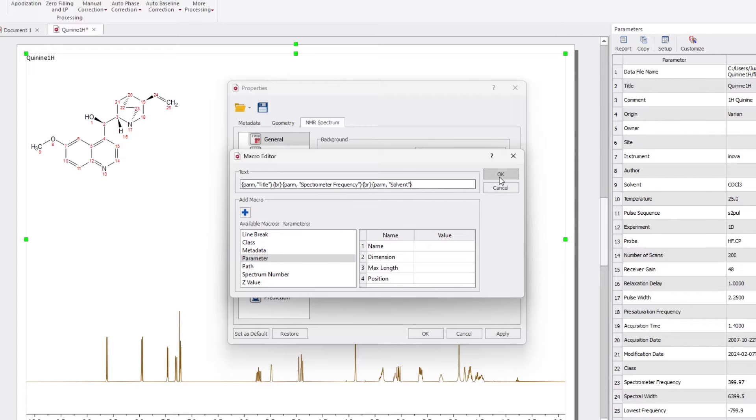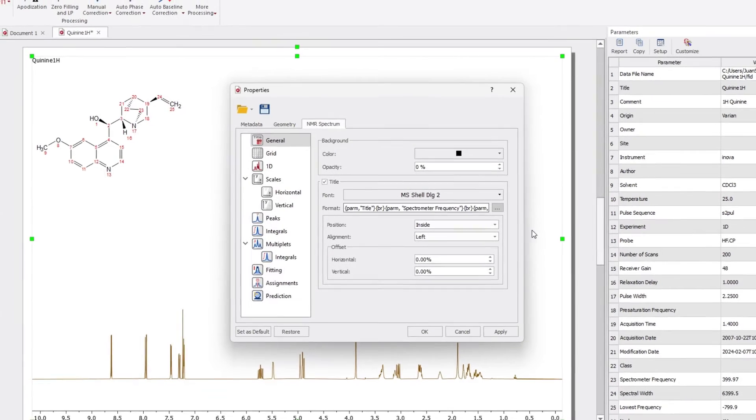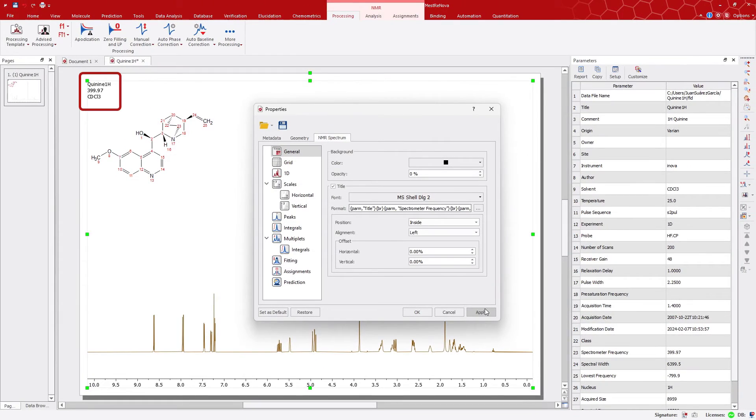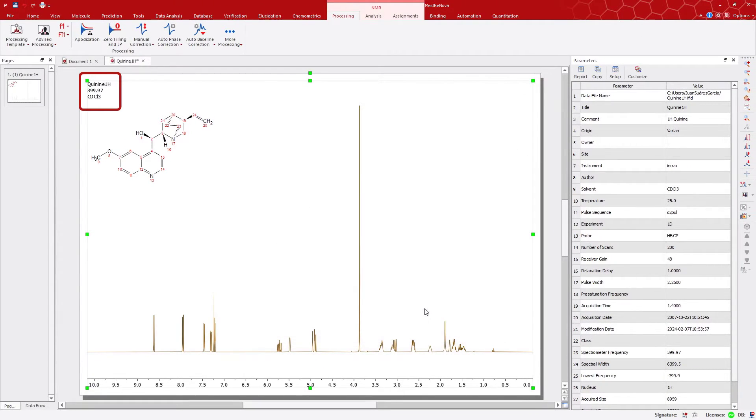Click OK, and then Apply. Your spectrum title now includes frequency and solvent information.